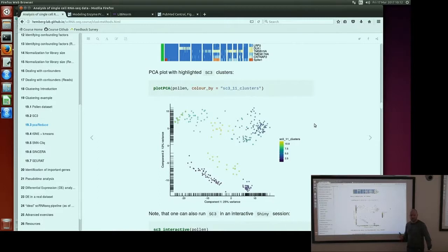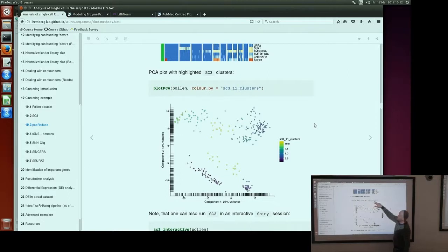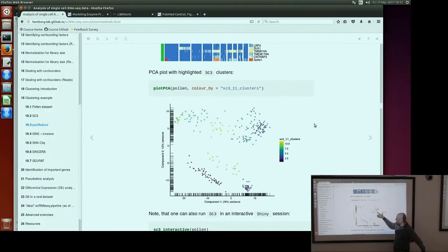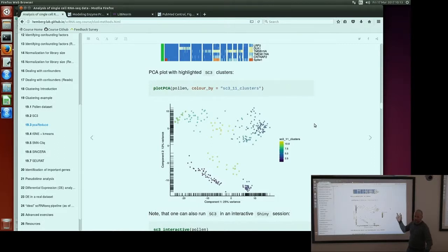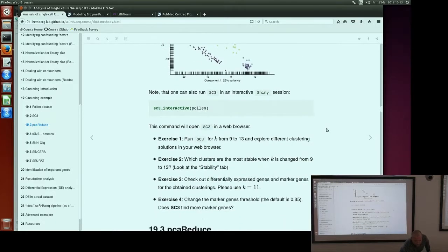Because of the integration with SCATER, you can use all SCATER functions on this object, and also use SC3 results in your plots. Here we plot PCA of pollen colored by the results of SC3. As you can see, it's very similar to the previous plot, because the cell types identified by SC3 were mostly the same as reported by the authors. The color scale here is continuous so it's not very clear, but still the same cell types. We have some exercises: run SC3 from 9 to 13, explore different clustering solutions in your web browser, and find out which clusters are the most stable.